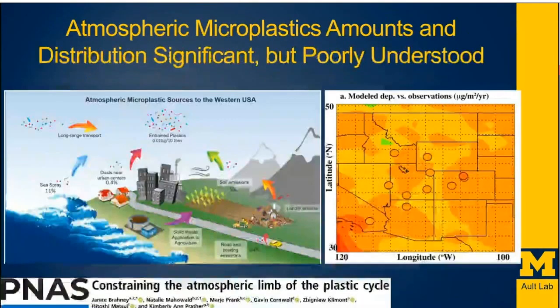And the last thing we've been working on more recently is trying to understand microplastics. Microplastics are really readily accessible by Raman and IR. One of the challenges, as with all things with Raman, is that if you have fluorescence, it can be a real challenge. And a lot of atmospheric molecules have a tendency to fluoresce. And so that's part of why we've been chasing the OPTIR, to see if that can help us get around that issue.